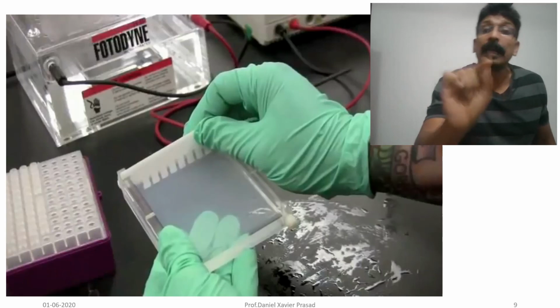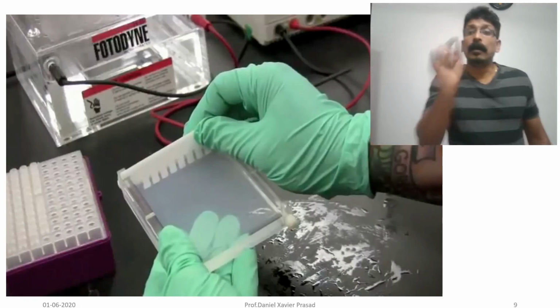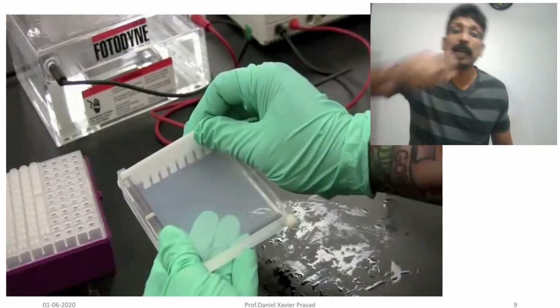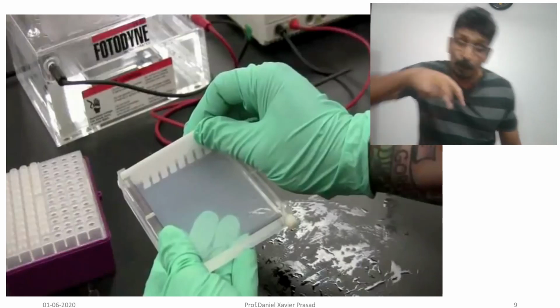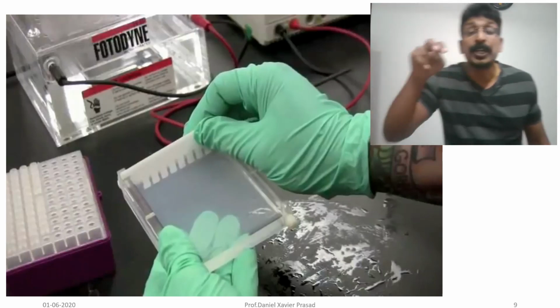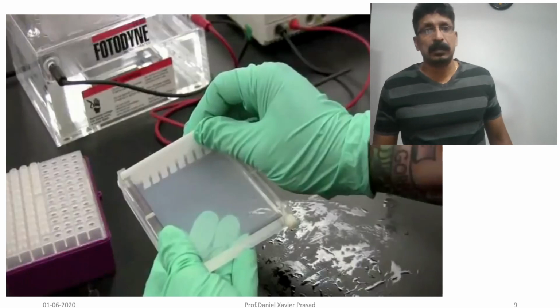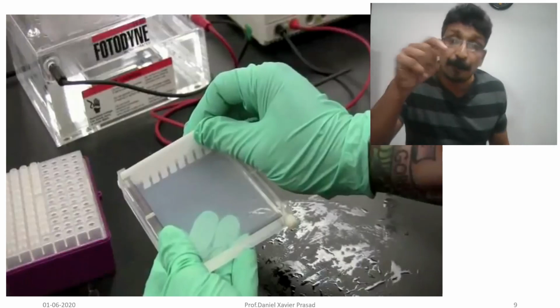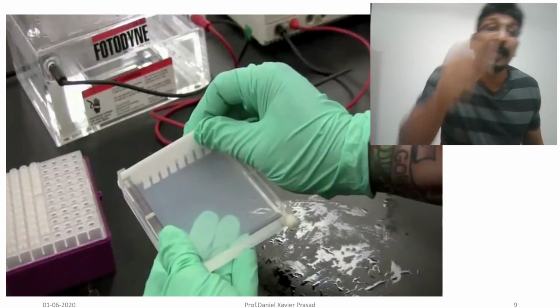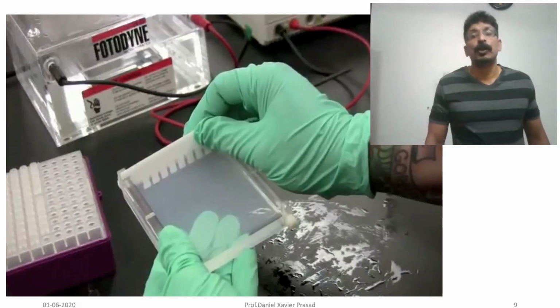There are a lot of pointed gaps, like teeth. That will be removed, and once it is removed, you will get holes. Those are called wells, which are ready for filling with your DNA sample with enzyme. Understand? It should be filled there, and there will be two electrodes in the same plate. One will be negative, another positive. That is what you have to see.